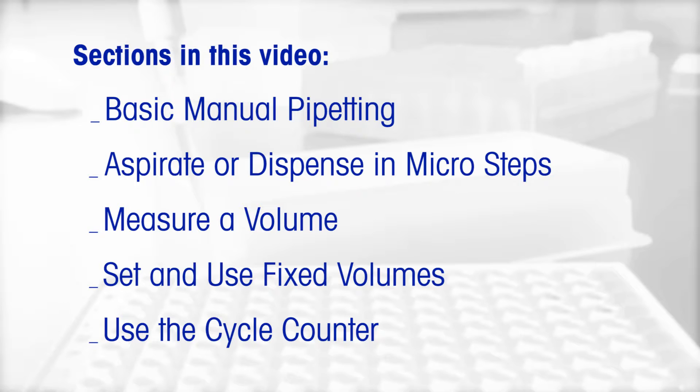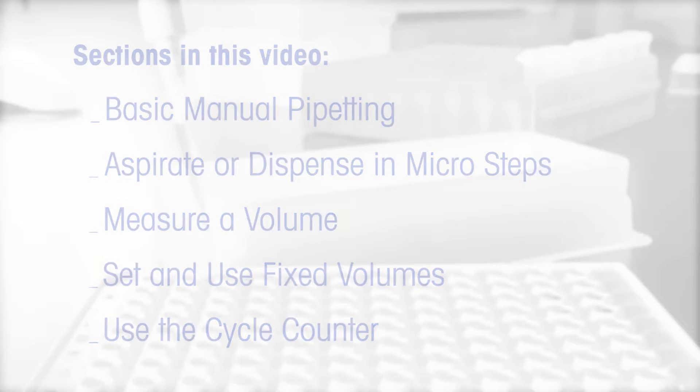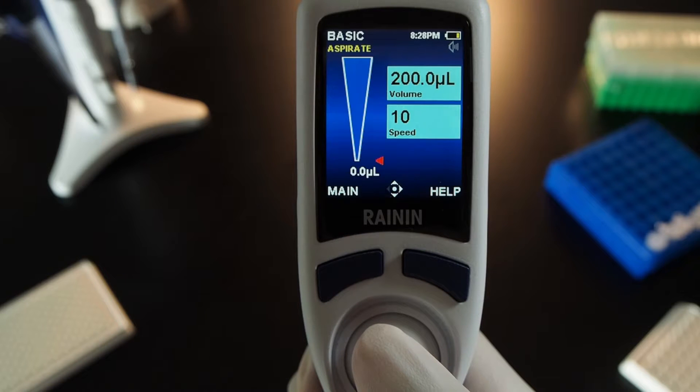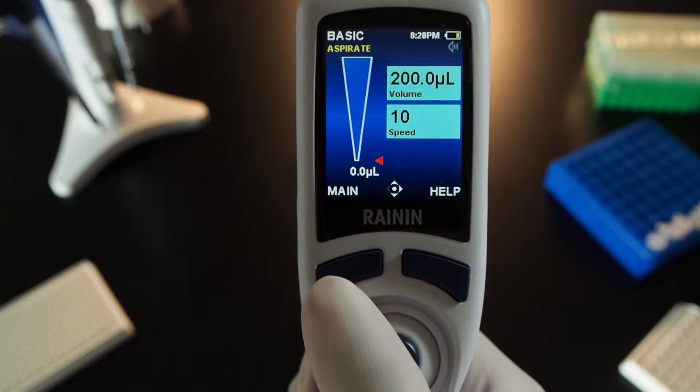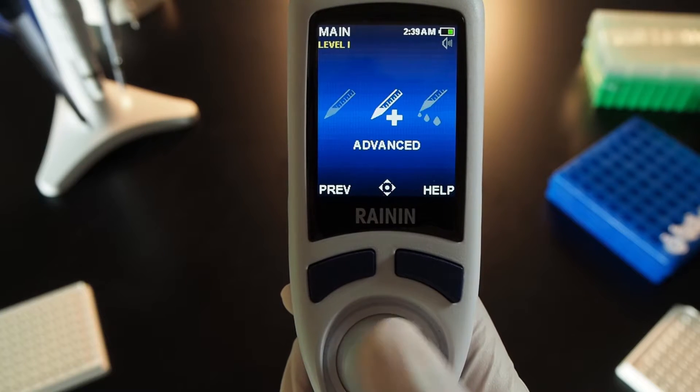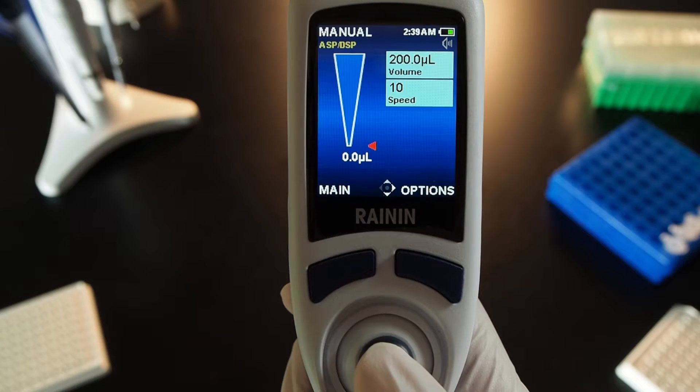Additional sections include: measure a volume, set and use fixed volumes, and use the cycle counter. Press either button above the joystick to turn on the pipette, then press the button on the left. Move the joystick right or left to navigate to Manual and push the joystick up to choose it.